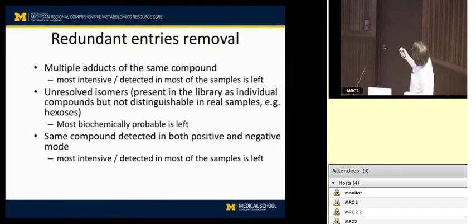And then we try to make sure that when we name the compounds, we don't have redundant features. So the software will sometimes pick the same feature twice, even though they're really close together in retention time. Every once in a while it'll do that, and if that gets named twice, we try to reduce that data first before you get it.